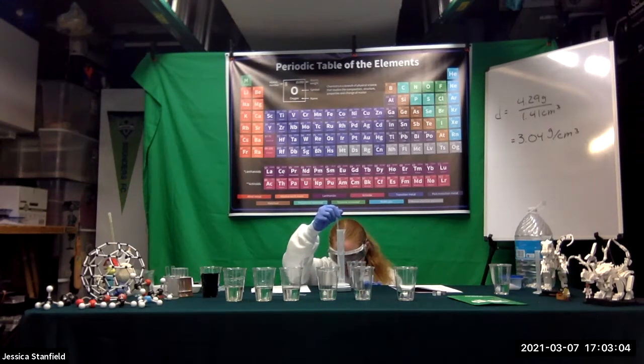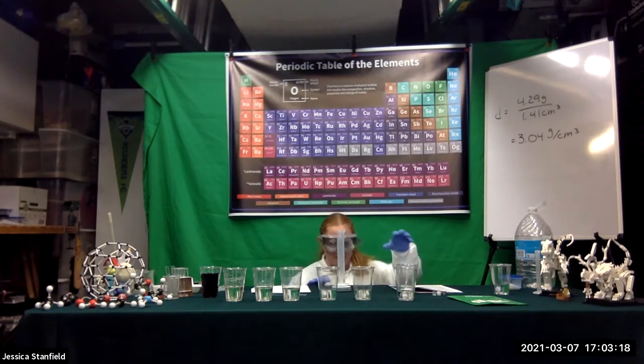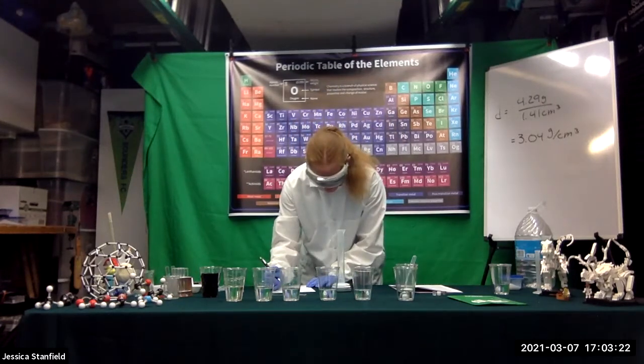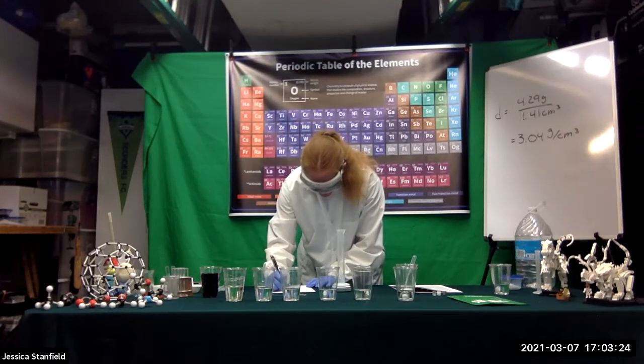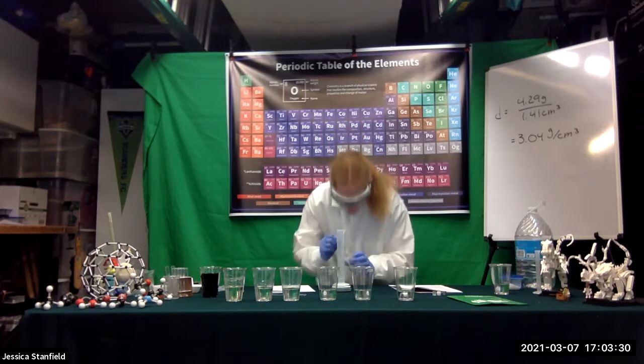And I got down to eye level because I want to get to that 5.0 mark. Looks like I need another drop or two to do that. All right, there we go. I have my 5.0 milliliters. So now I'm going to look at my reading, and I have 34.47 grams.